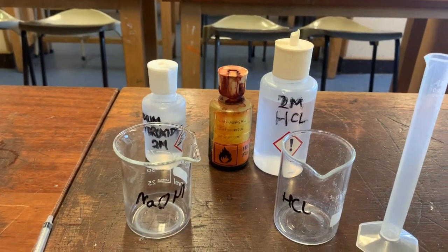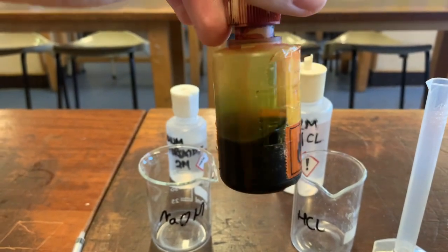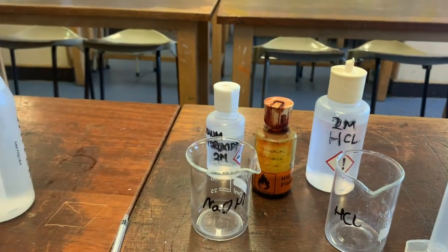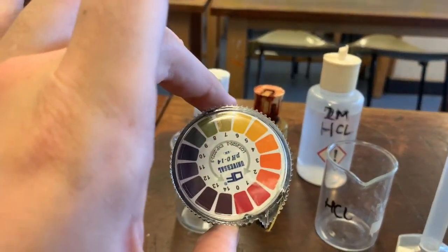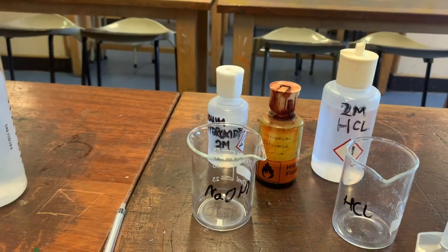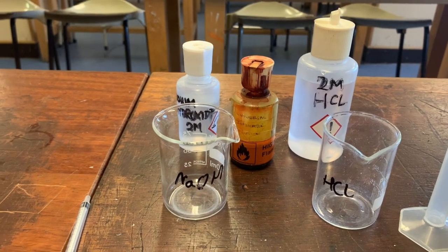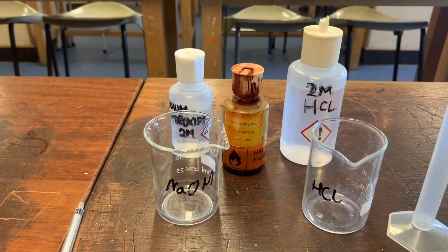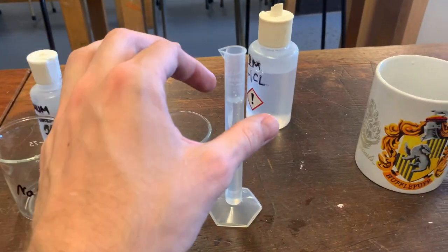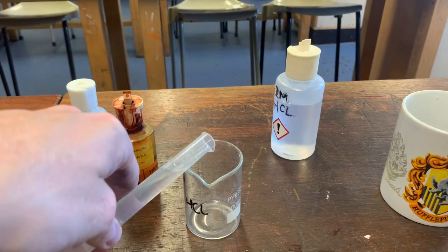To test the pH, I'm going to be using universal indicator solution. This is exactly the same chemical that was on the pH paper, but in liquid form instead of stuck onto paper. The colors should be very similar to what we're used to already, and we'll be able to use it to see what the pH will be.